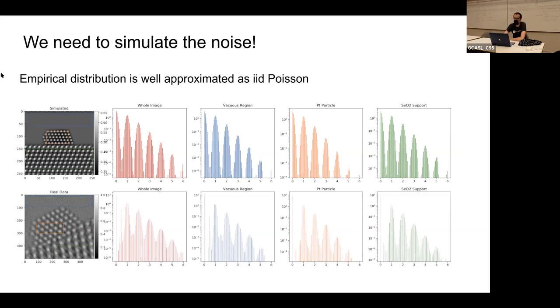For the unsupervised methods, are you just trying to find structures you don't even know if they exist or not? Actually, maybe we can explain quickly. In these unsupervised methods that Shreyas refers to, what you tell the network to do is approximate each pixel using every other pixel. But you tell it to approximate the noisy pixel. The idea is that if you ask it to approximate the noisy pixel using every other pixel, including that pixel, it's going to copy that value and be useless. But if you don't allow it to use that particular pixel, this induces the network to denoise.